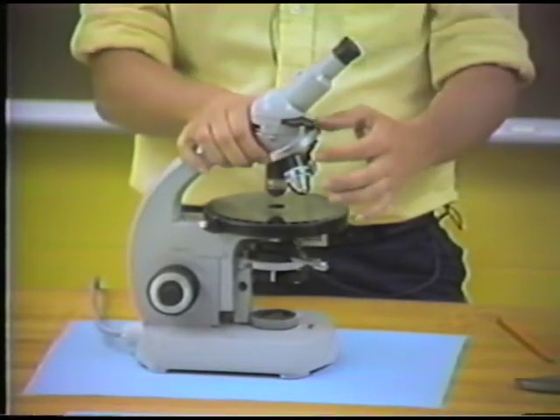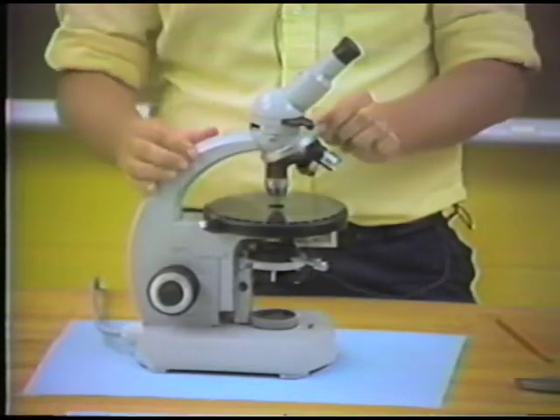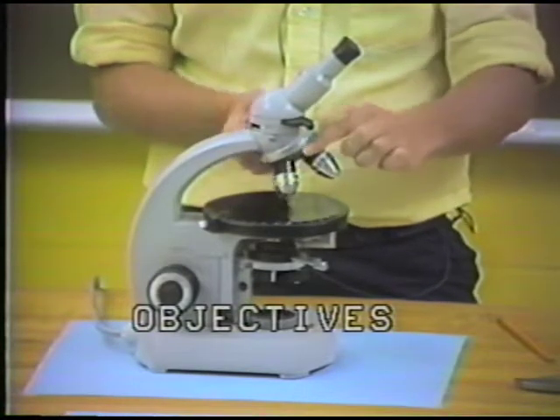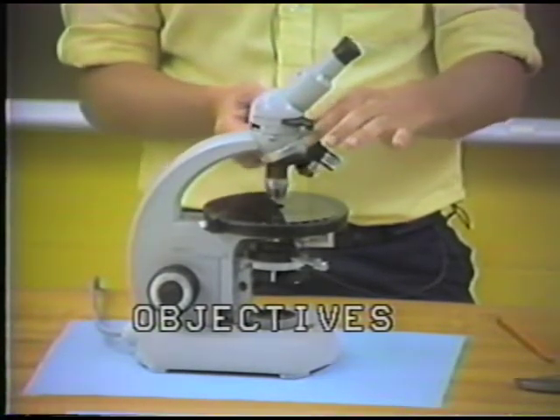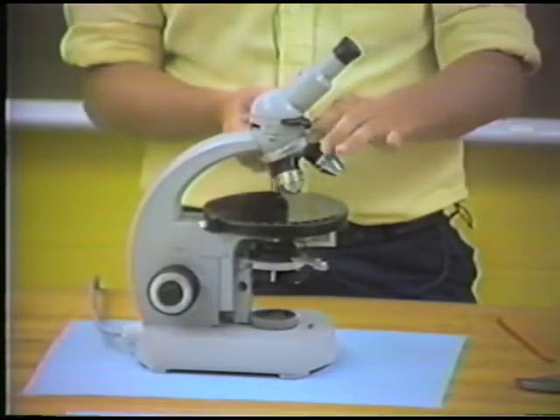So I'll put the ocular back in and move to the next bit of optics, another very important part of the microscope, which is held here on a turret: a series of what we call objectives of the microscope. These stick out in this position and can be rotated to the vertical position for alternative uses.